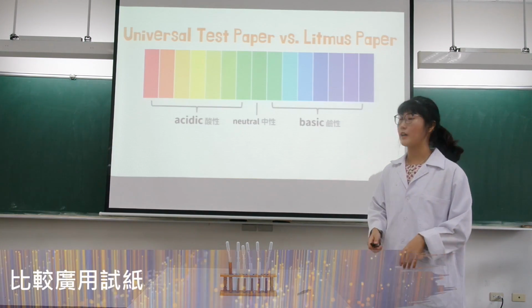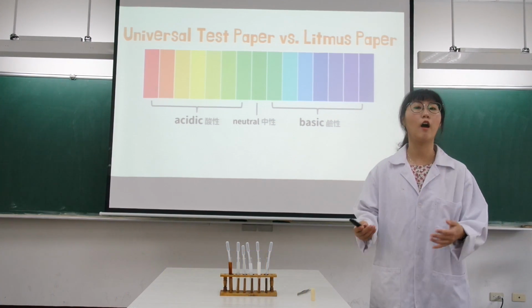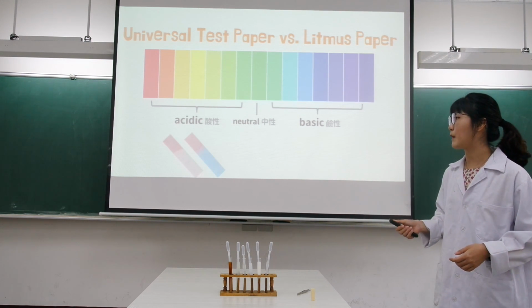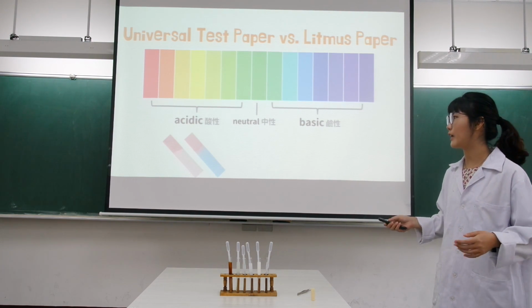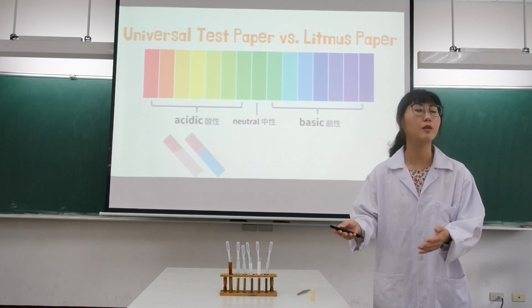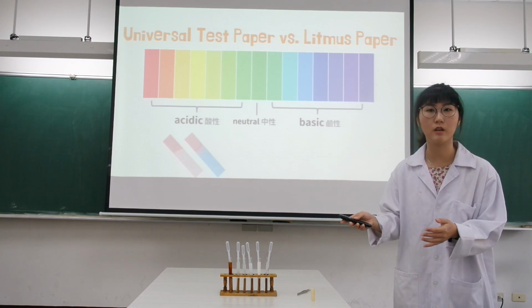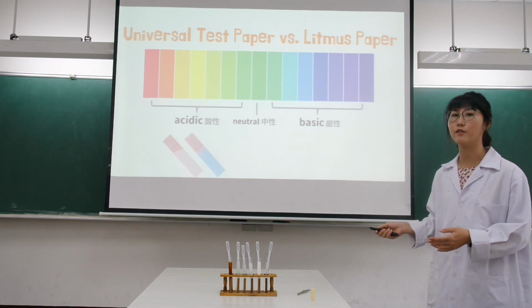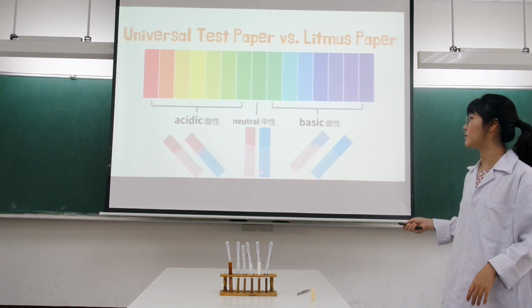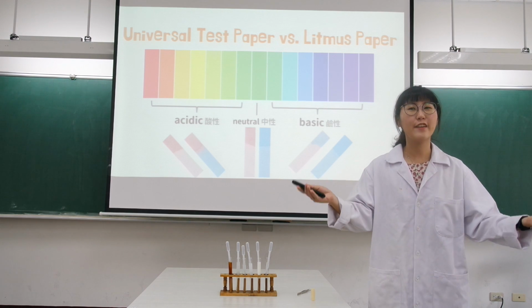Now, let's look at this one. So we know the universal test paper will turn to colors like a rainbow. And how about the litmus paper? So if the solution is acidic, the red litmus paper remains red. That's right. And the blue litmus paper turns red. Very good. So this is the universal test paper and this is the litmus paper. Okay? Everybody understand? Very good.